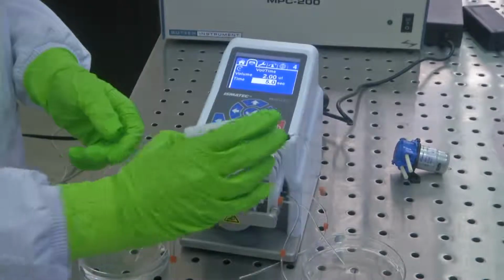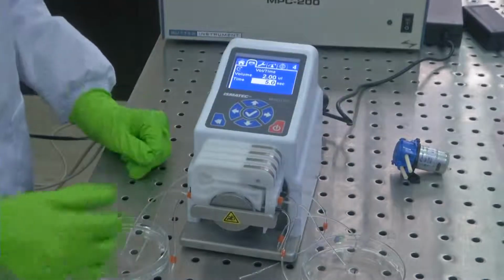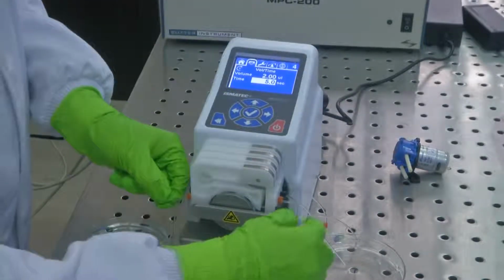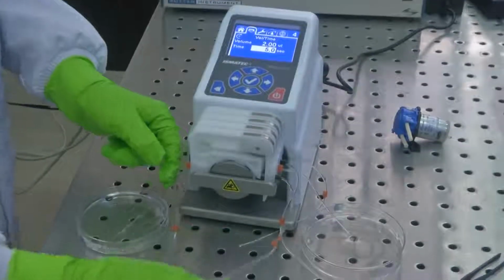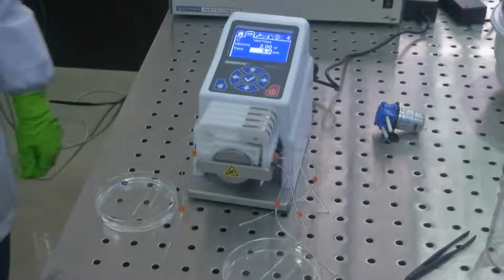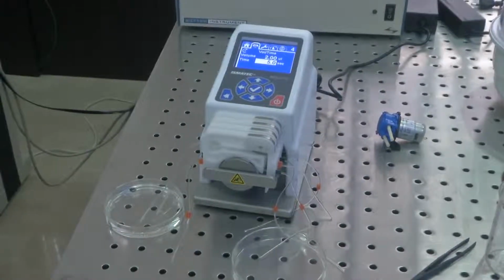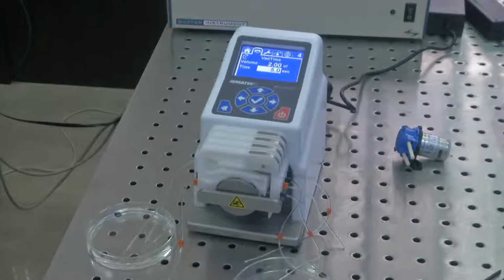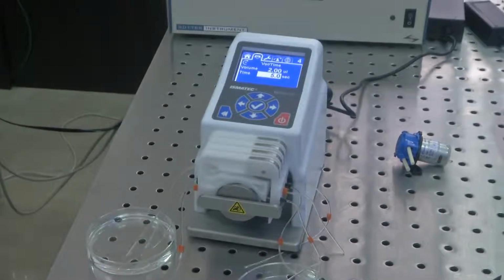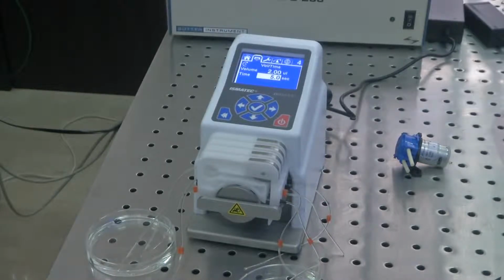So this entire pumping mechanism, the compression and the decompressing of the tubing, is to force the fluid to flow from one direction to the other. As you can see, this working is very much similar to how our body pumps blood, nutrition and oxygen, and this is why we are using this mechanism when we are mimicking the entire bioenvironment, the physiology, the chemistry and the biology onto our biochip, and hence using these pumping mechanisms becomes very important, and controlling the amount of fluid which flows through them becomes vital for the accurate functioning of our device.